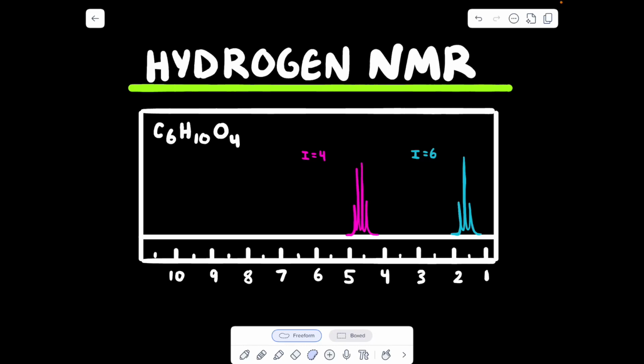In this video, I'm going to be interpreting a hydrogen NMR or a proton NMR.